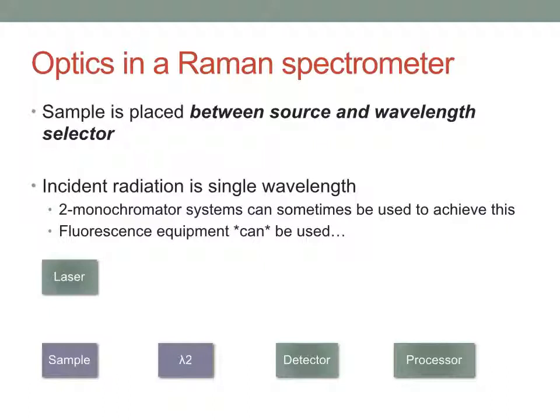There are variations on this theme. I'm specifically thinking about Raman microscopes. I don't talk about Raman microscopes, but they have the light coming in and they measure completely the backscatter, so they measure light at 180 degrees to the incident light. But we are always measuring away from the initial direction in. Detectors for Raman are PMTs always, just for the sensitivity. Raman is a very, very low signal thing.